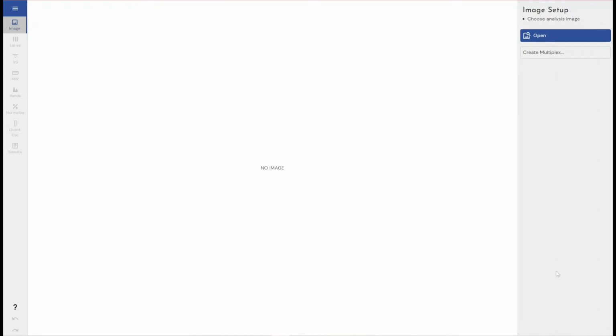of Phoretix 1D. Now, because Phoretix 1D is not associated with any particular equipment manufacturer, it's open to all equipment manufacturers. So any image that is exported in a .tiff, .png, .bmp or .jpeg file format can be analysed using Phoretix 1D. And this covers all modern gel documentation devices, densitometers, scanning devices, and even things like mobile phones and digital cameras. As long as they can export in one of those file formats, our software can analyse it.